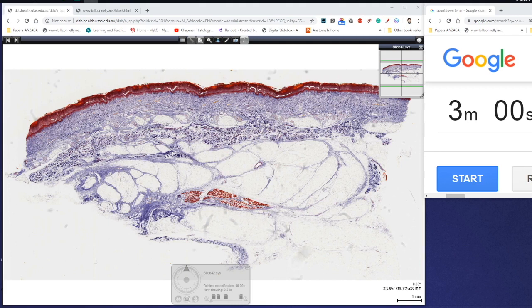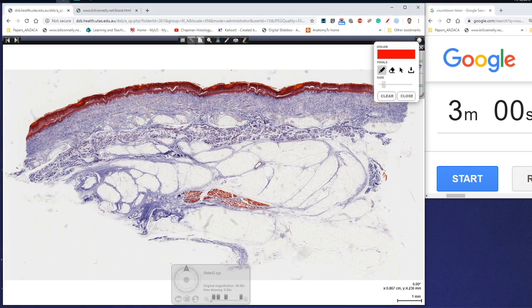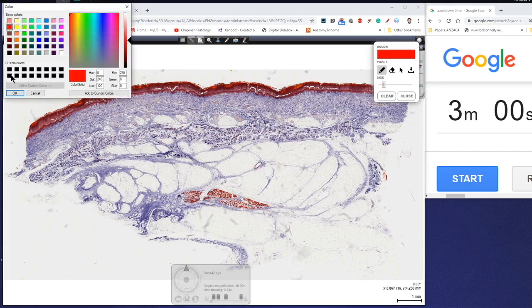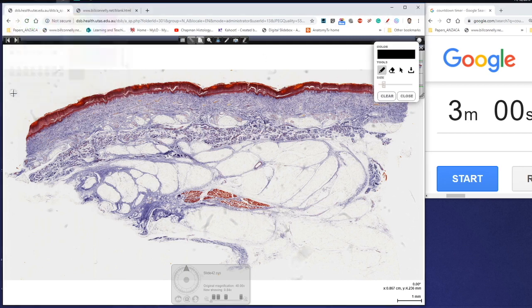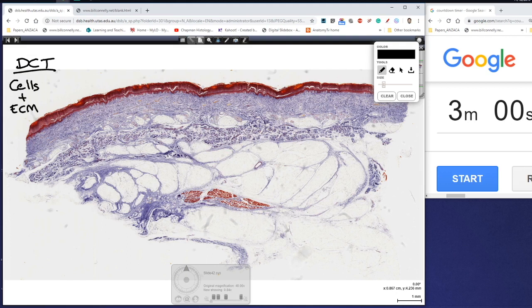If you remember, a breakdown of how we actually look at connective tissue — connective tissue is made up of two things: cells and extracellular matrix. We know the extracellular matrix is made up of ground substance and fibers.